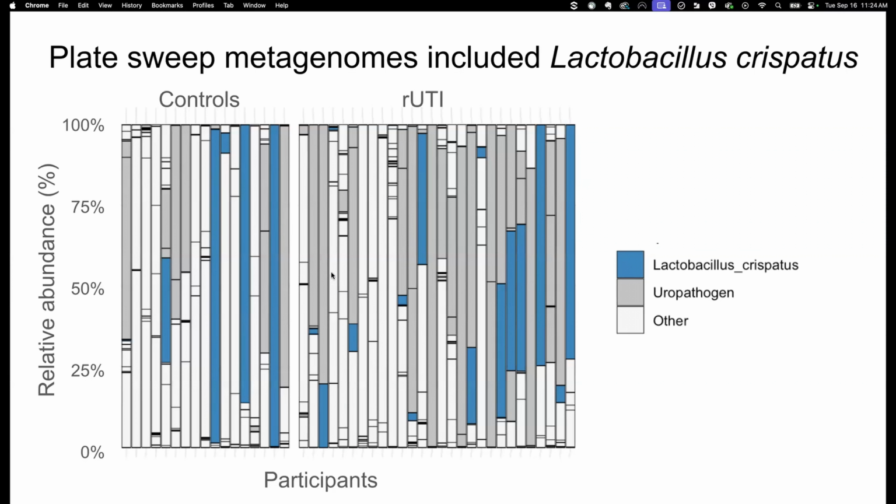And what we find is that, in fact, we see there are uropathogens. These are the darker gray species shown here. But we also see Lactobacillus crispatus. It turns out Lactobacillus crispatus is a facultative anaerobe, meaning that it can grow in the presence of oxygen, and did so on these plates. And what was cool about that is it gave us an opportunity to dive a bit deeper.